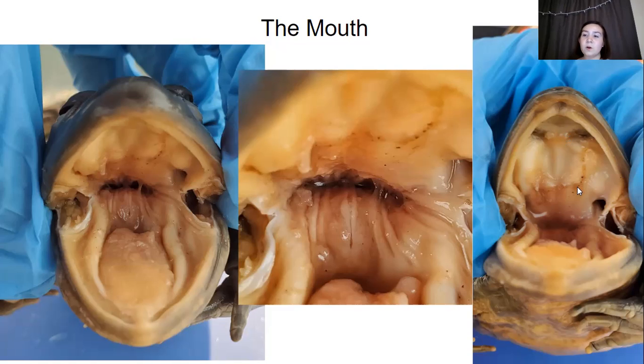And then it's a little bit hard to tell here, but these holes right here, those are the nares. These nares are essentially holes that are used when a frog breathes. You can see with the nose, they also have holes on this side. They can inhale and exhale, and the air goes down their throat. Apologies.